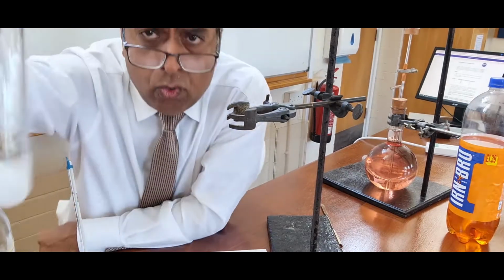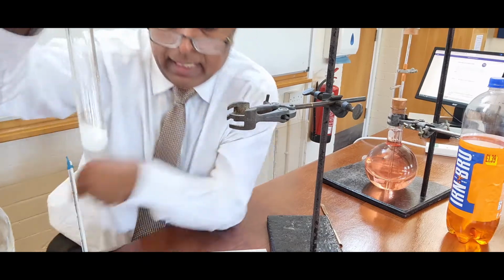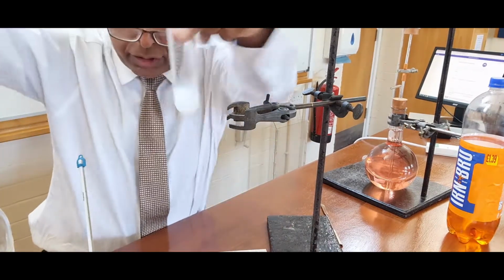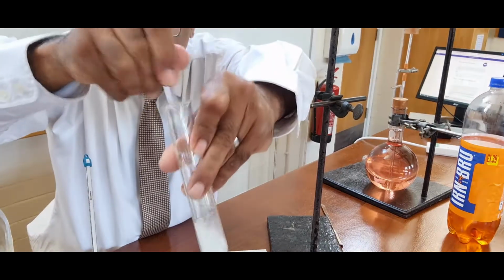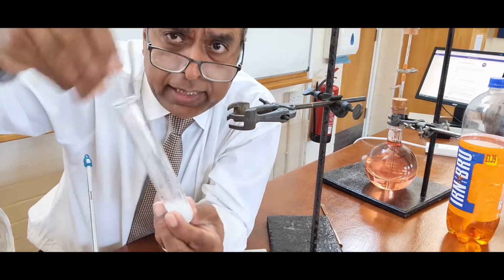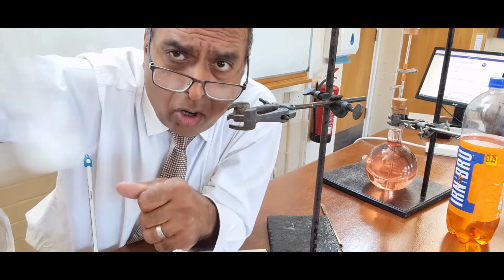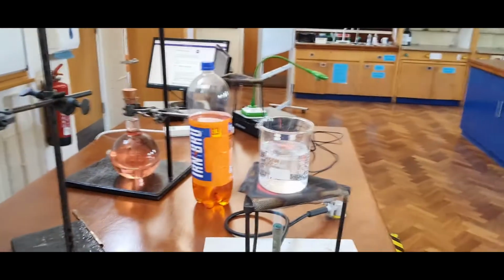Now, ammonium chloride in water, I can try and dissolve it. I can get a glass rod and stir it all up, and it won't dissolve all of it. It won't dissolve because I've exceeded the solubility at room temperature. But what if I had hot water?